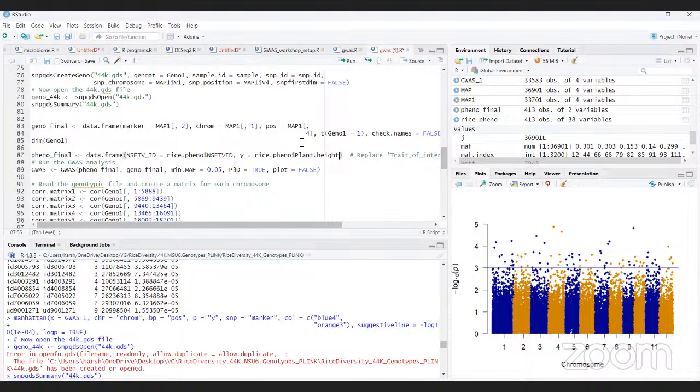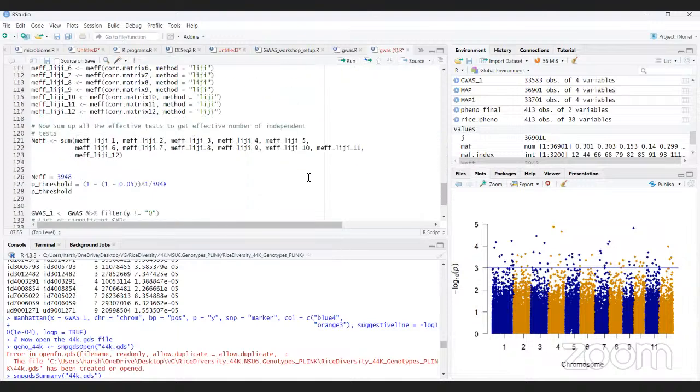As discussed the other day, I think it would be better if I show you, so you could understand it much better. If you try to visualize the data, how it is going to be, it's going to be the ID, followed by the name and the chromosome position, followed by the phenotypes, right? You get different phenotypes. In this data set, you can see different traits. We are selecting one trait out of it, that is plant height, and we are processing the whole process for that.